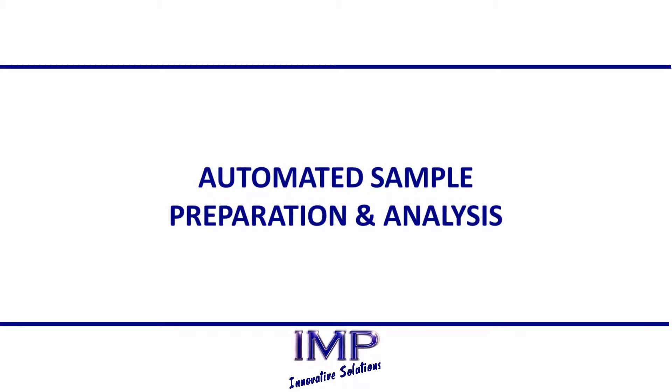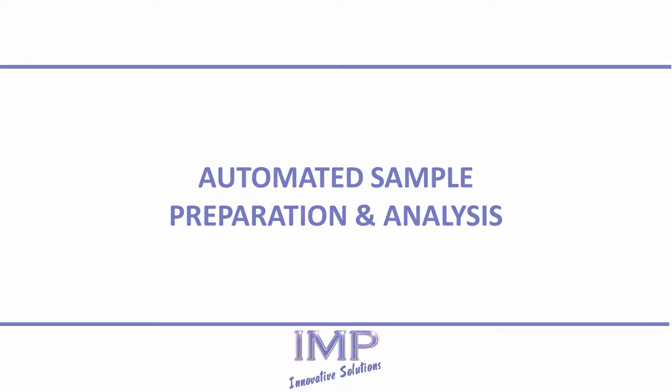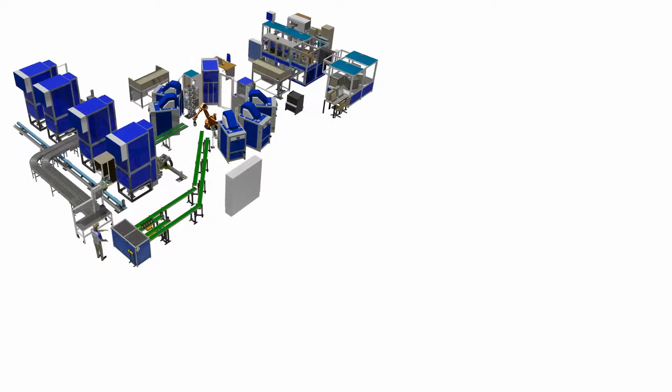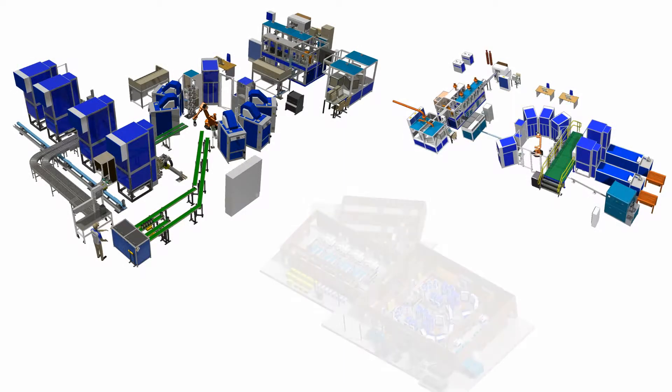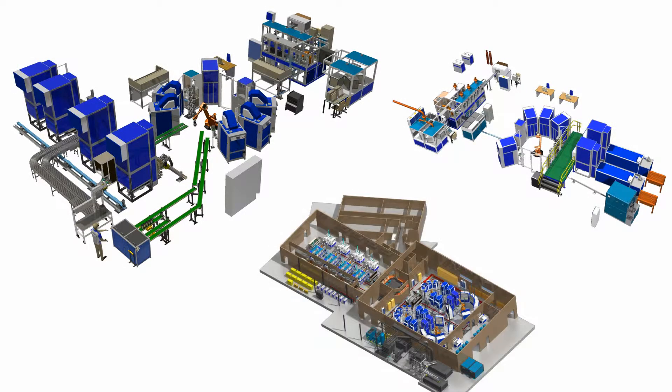IMP is a world leader in the field of automated sample preparation and analysis and has designed and delivered numerous turn-key laboratories to major mining companies around the world.